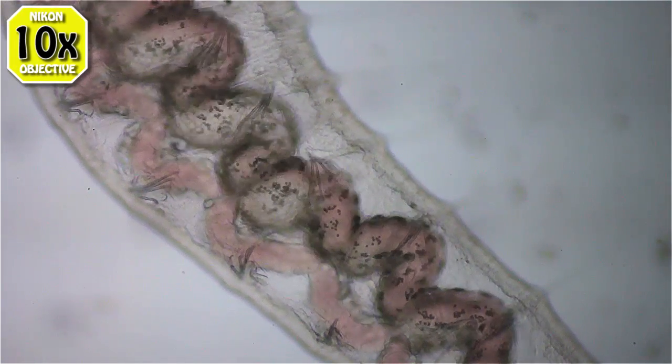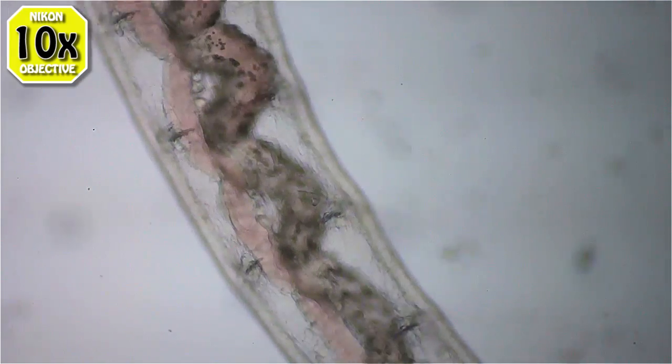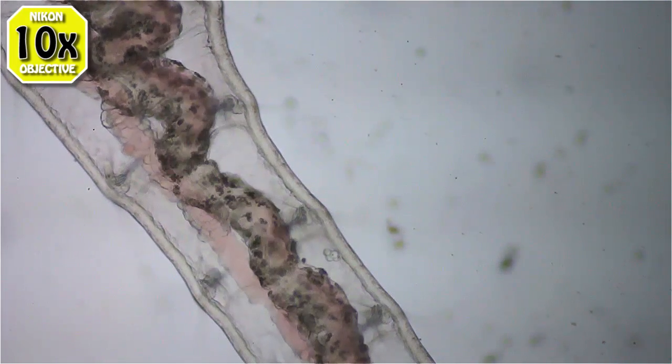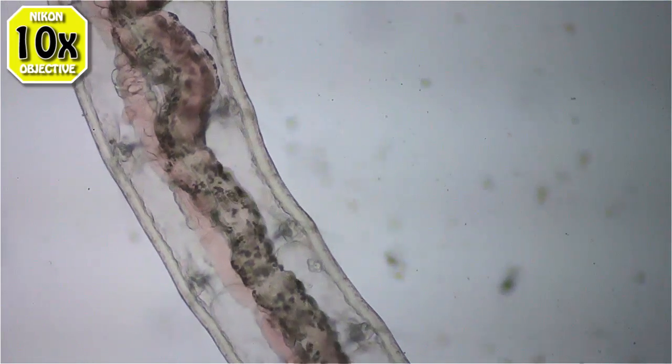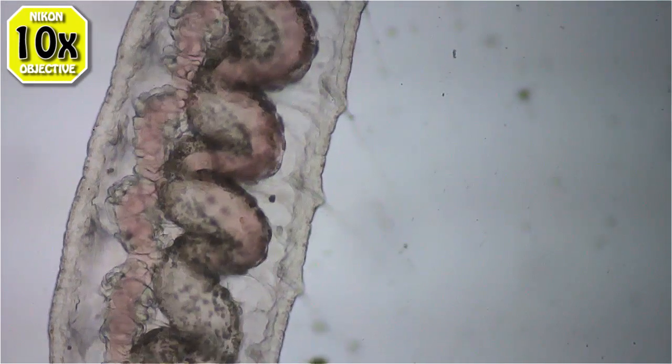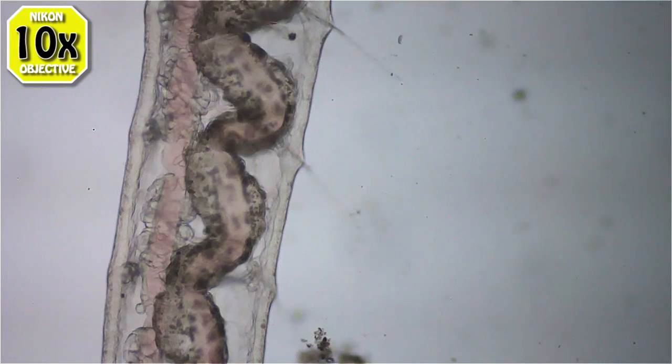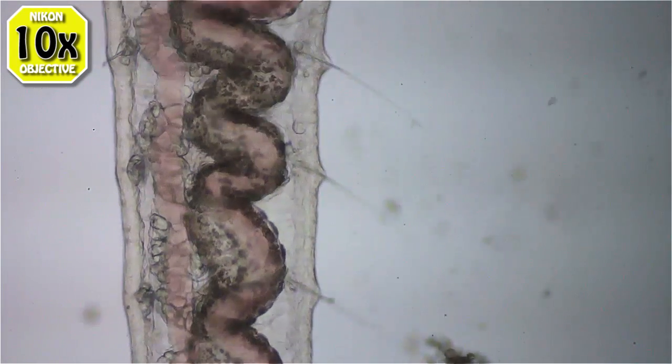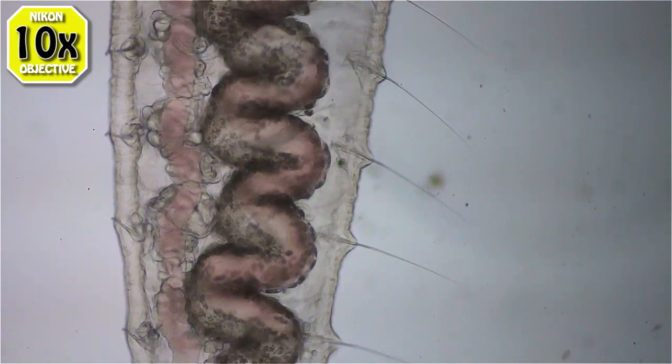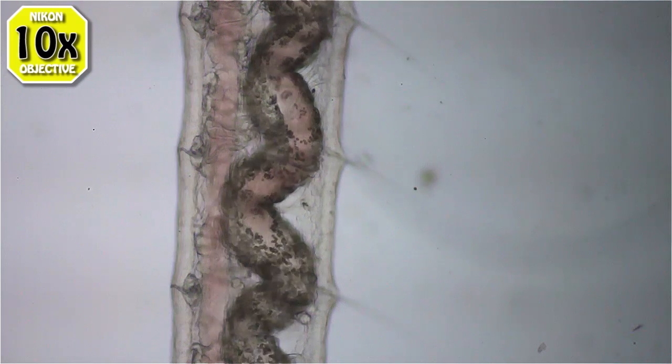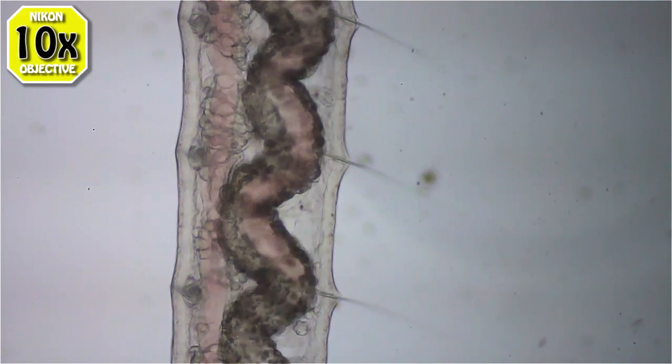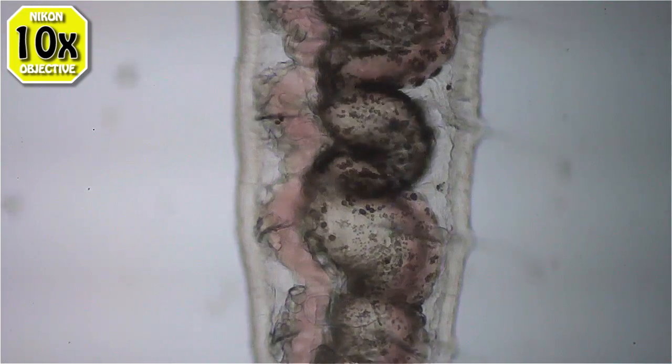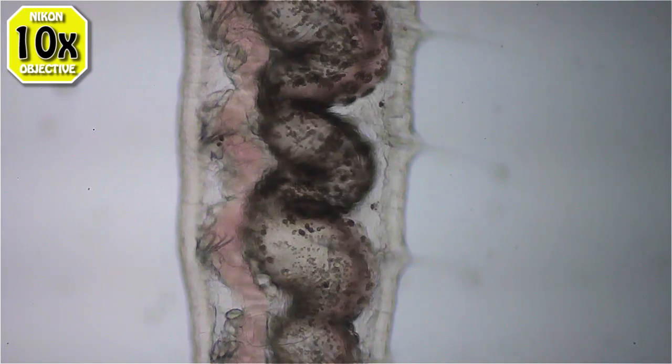He seems to have no heart. I guess he pumps his bodily fluids around just by, well, the gut there has a muscular contraction, so maybe that artery thing does too. It seems, yes it does seem to have some sort of contractions going on in it.